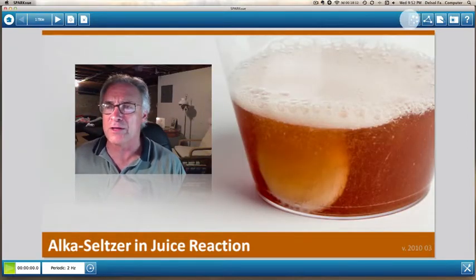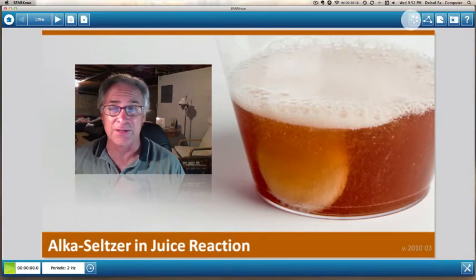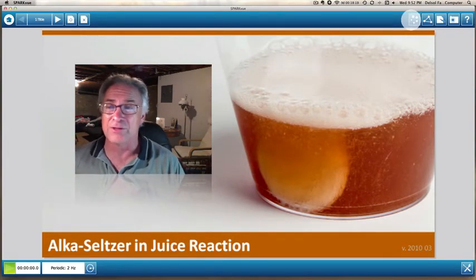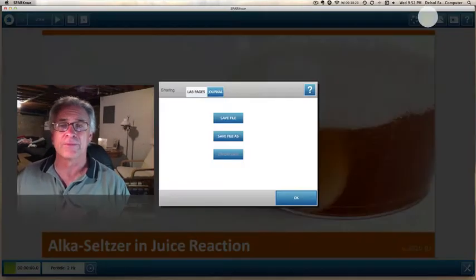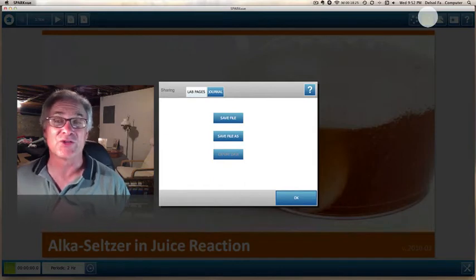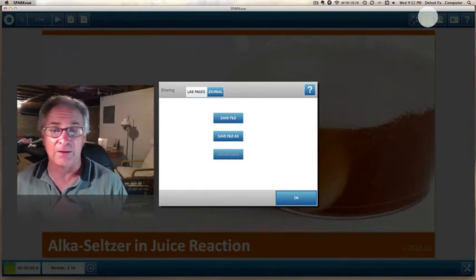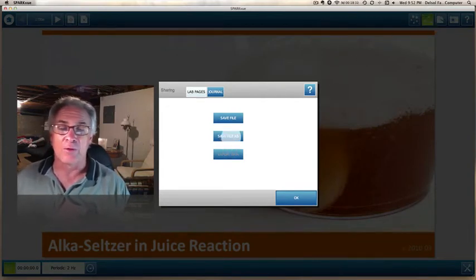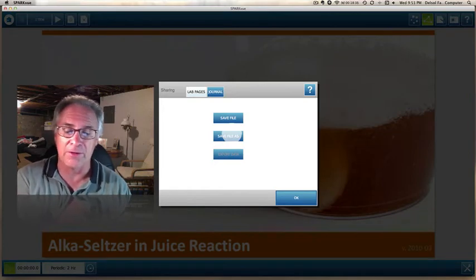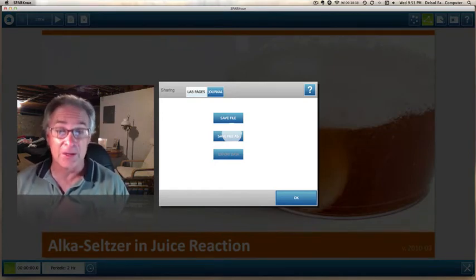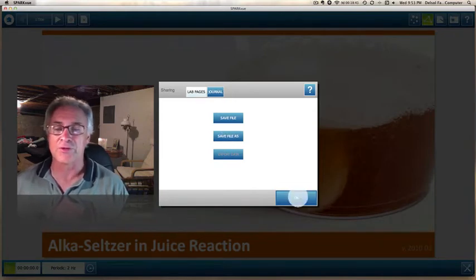And then if we go over here, these little dots just tell us a little bit about the version of the operating system that's on the data logger. It tells us the languages you can convert it to if you need to. This is our network button. And one of the ways we can save our journals is by, just like a computer, file save or save as. And we're going to be using the save as command.